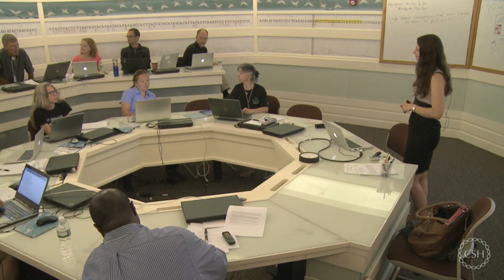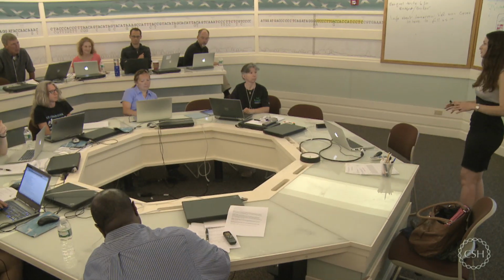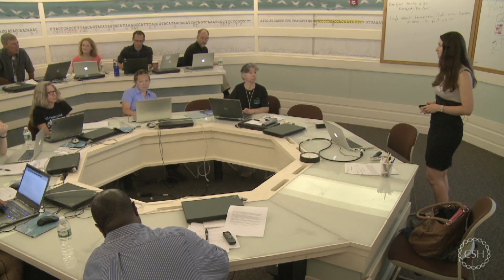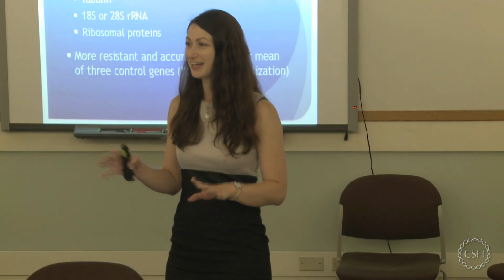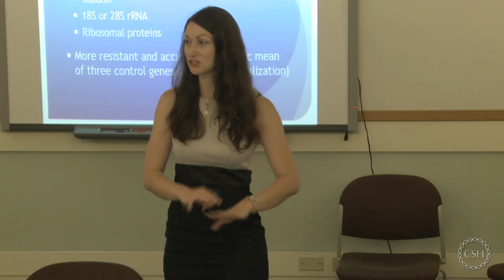It seems to me that the limiting step is the efficiency of your cDNA. Yeah, that's absolutely correct. So how do you validate or estimate the relative? That's a very, very good point. So of all these things, although the qPCR is actually quantitative, the cDNA synthesis is not at all.